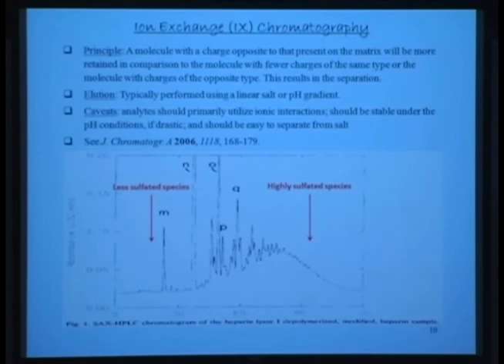So in essence you can see that this is one peak and there are several peaks. Each of these, and I had used two-dimensional NMR to characterize, I don't remember one of these. Okay, but we got about 6 really clean hexasaccharides for the most part, and we determined the exact structure. Most highly sulfated species, obviously these are really the long things.